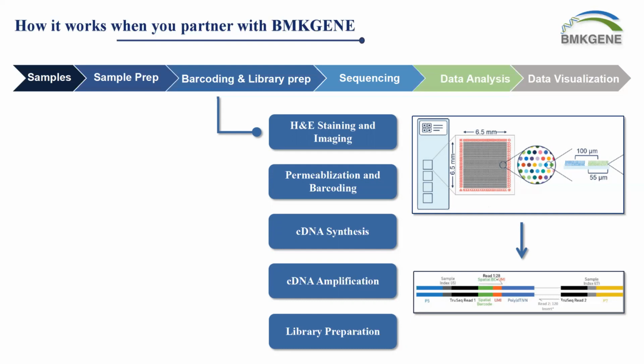And the barcoded cDNAs will be harvested and amplified, and go through the normal library preparation step to make a structured library where we have the adapters, a spatial barcode, UMI and poly-dT part, and the real insert that represents our mRNA molecules.